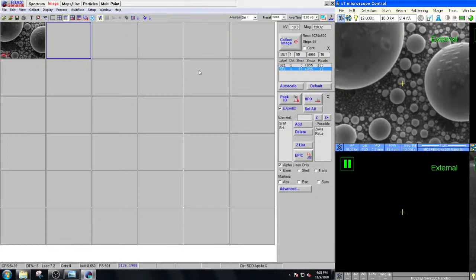Let's move on. We just have a little bit of time left. Let's move on to the last and probably the most important thing. Hold on a second.